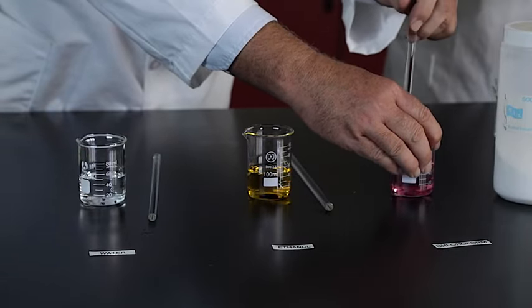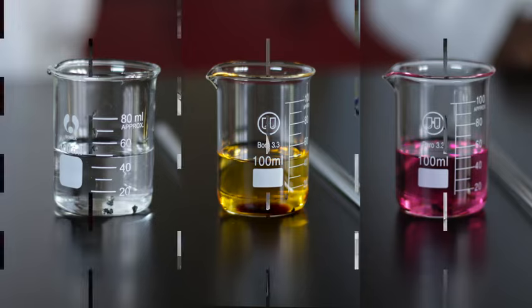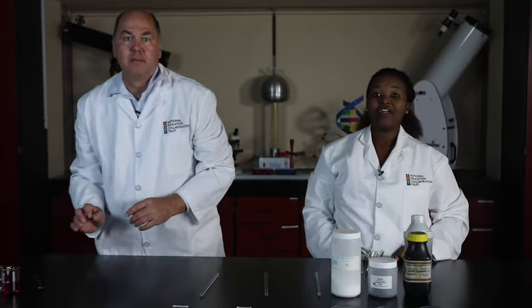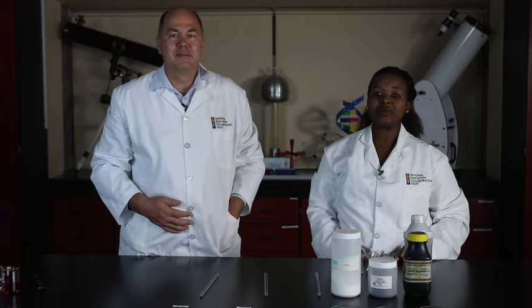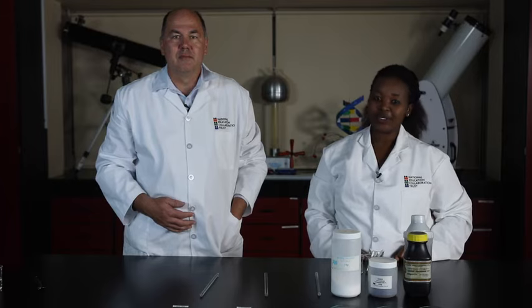Let's look at all 3 mixtures together this time. Okay, there are some changes in all 3 beakers. First, we have iodine in water. Second, we have iodine in ethanol. Finally, iodine in chloroform. I'm now going to remove the mixtures from the desk. There you are. Those are the results of the experiment for these 3 substances. We have finished our investigation on solubility.